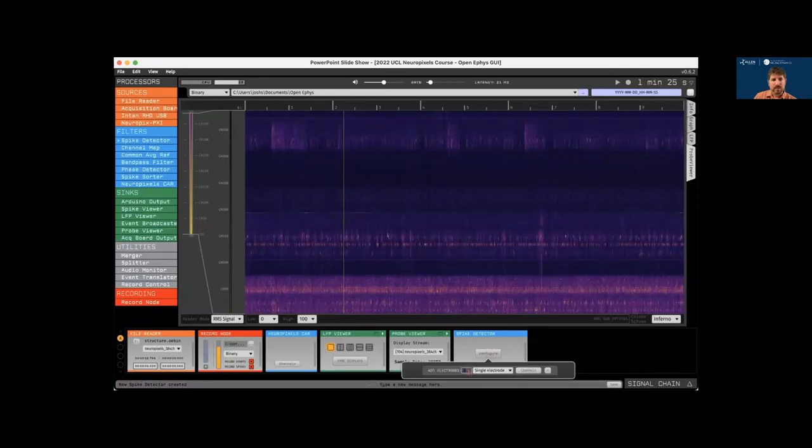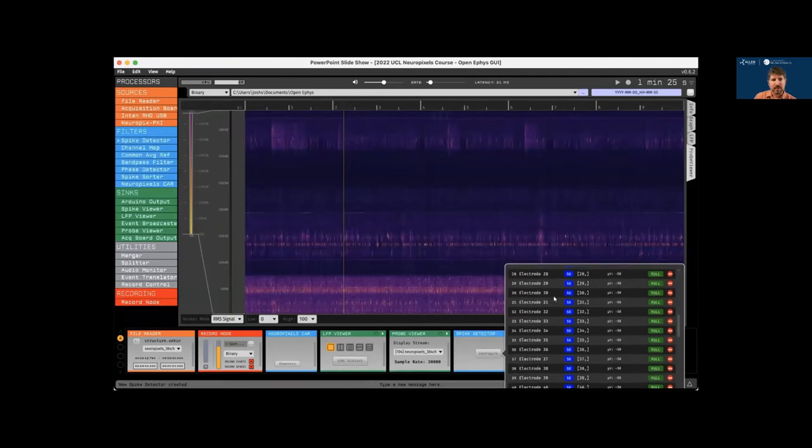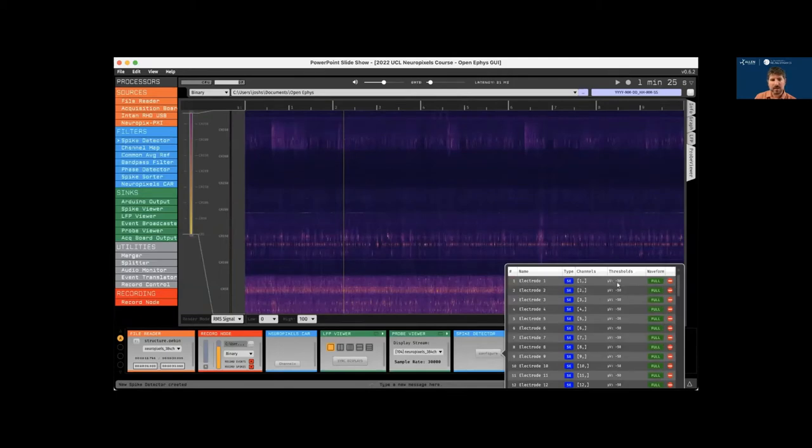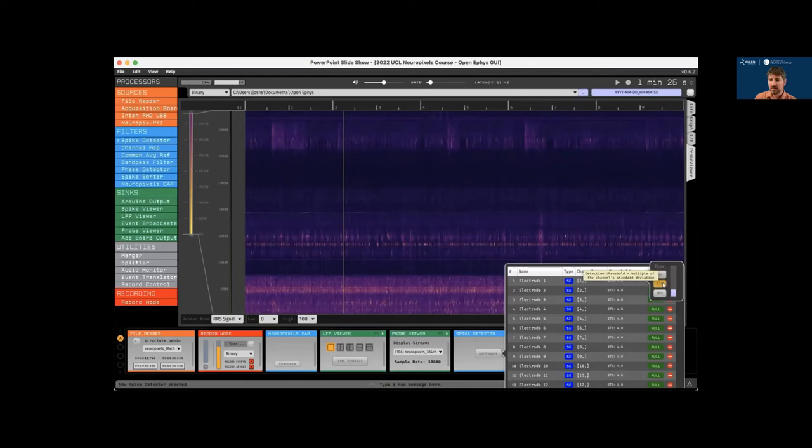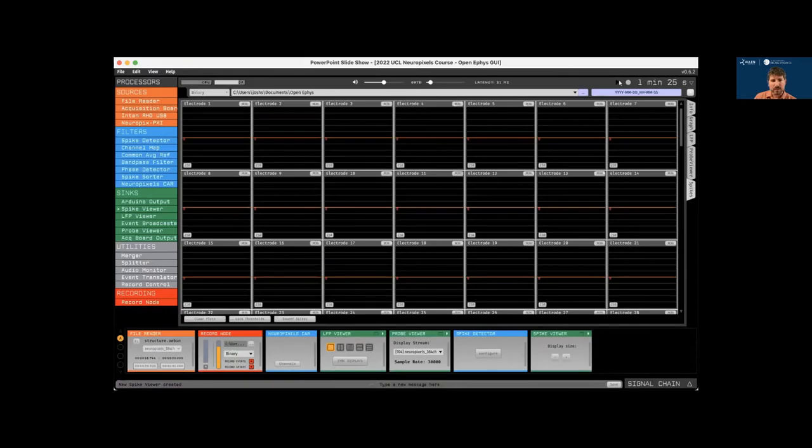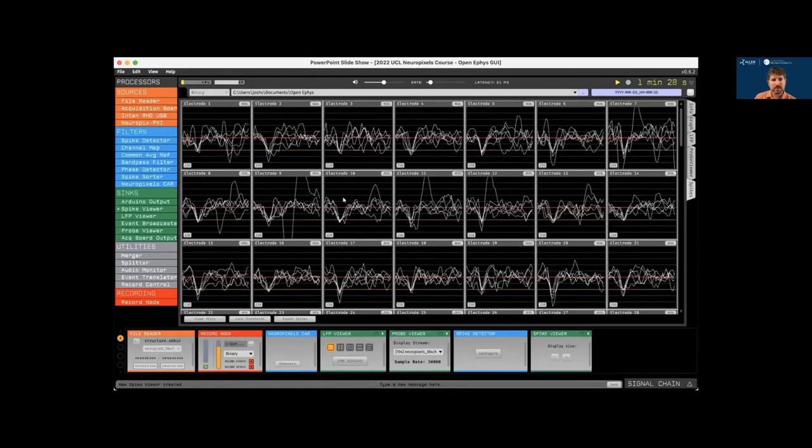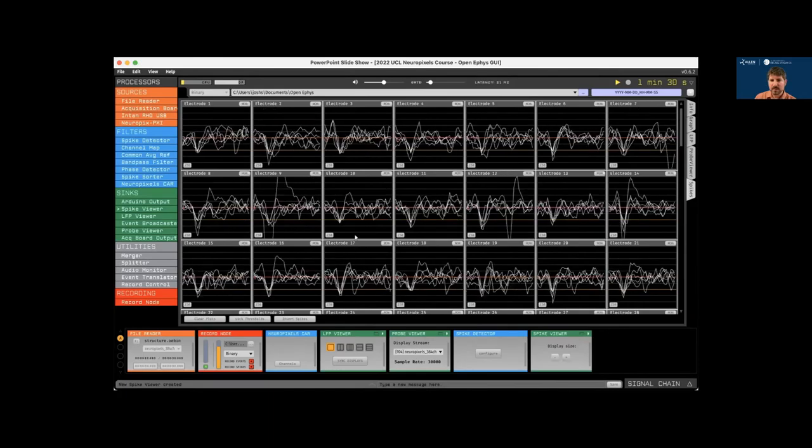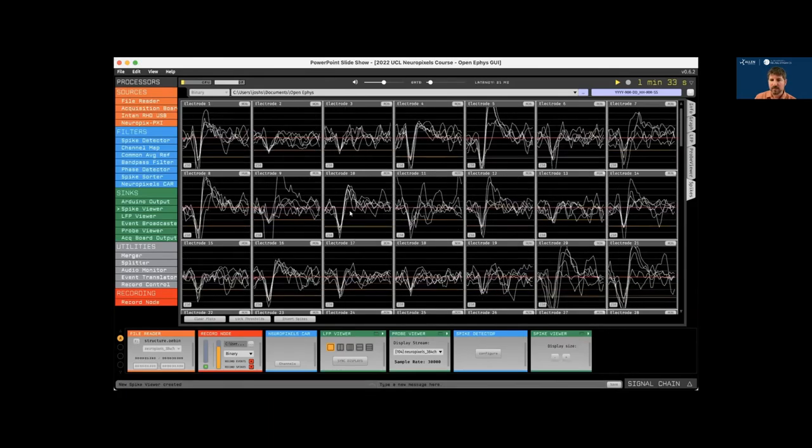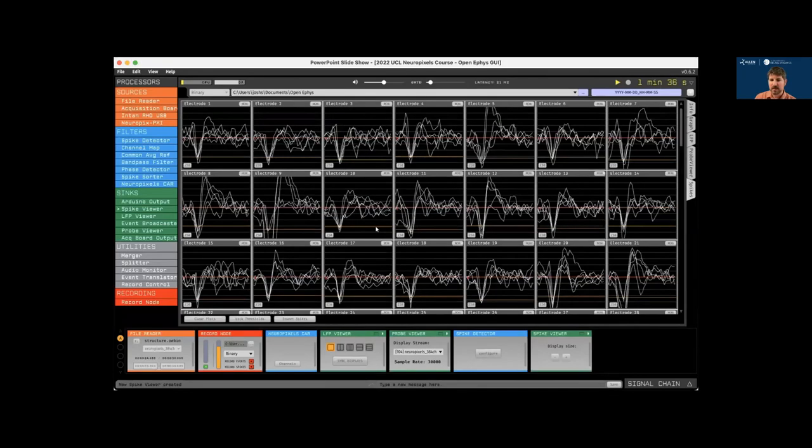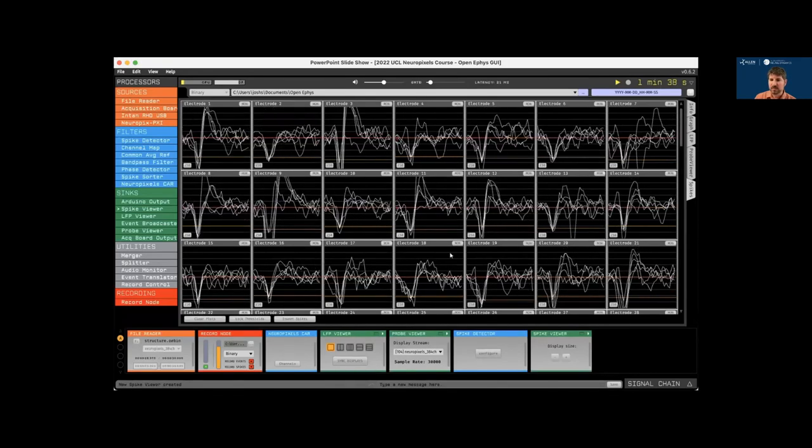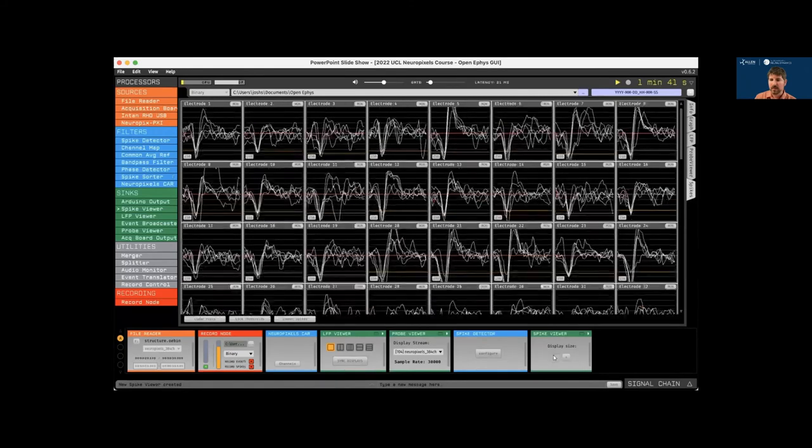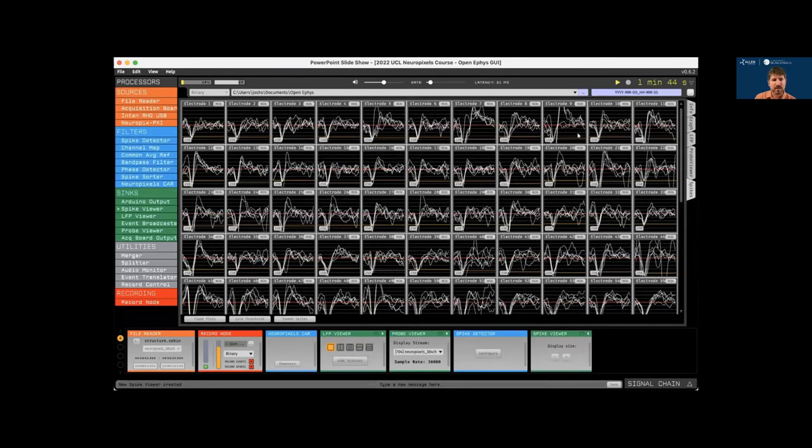So now let's drop a spike detector plugin to the right of the probe viewer, set the number of spike detection electrodes to 100, and then hit the plus button to create these. And then we can hit control A to select all the electrodes and switch to an automated thresholding method that's based on the standard deviation of the incoming signals. And we can use this interface to easily adjust the threshold for all of the electrodes at once. And then we'll add a spike viewer, start acquisition again. And now we can see the spike waveforms across all of these electrodes. In a second, the thresholds will adjust automatically. There you see each one is now customized to the individual electrode. We can decrease the display size so we can view more electrodes simultaneously.